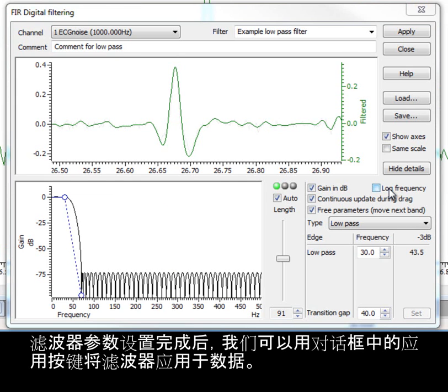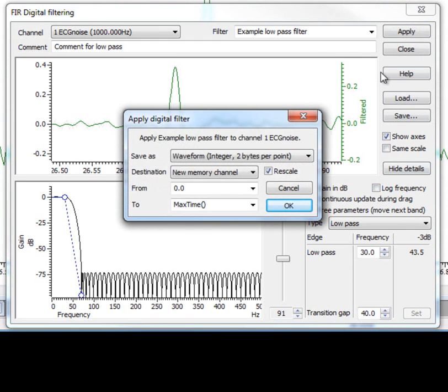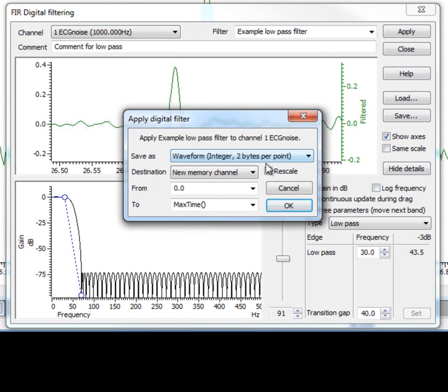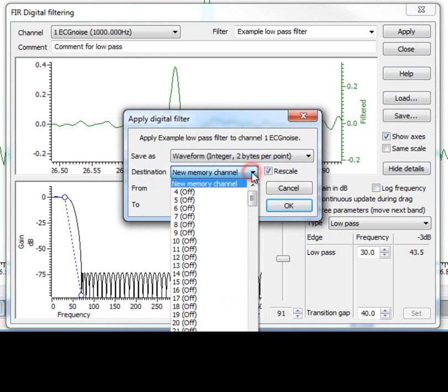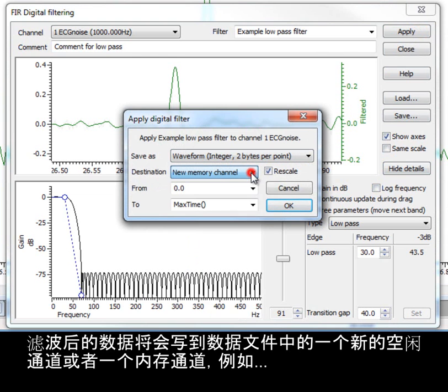Once you are happy with the filter settings, we can apply the given filter to the data using the apply button in the dialog. Filtered output can be written to a new free channel in the data file, or a memory channel.